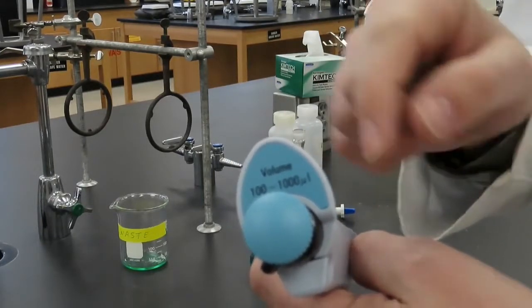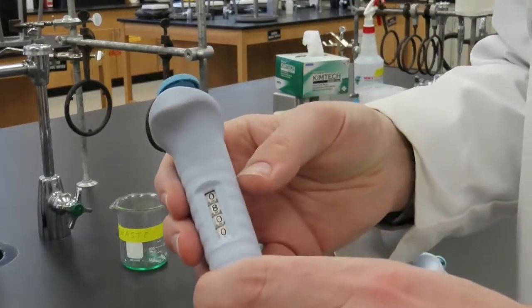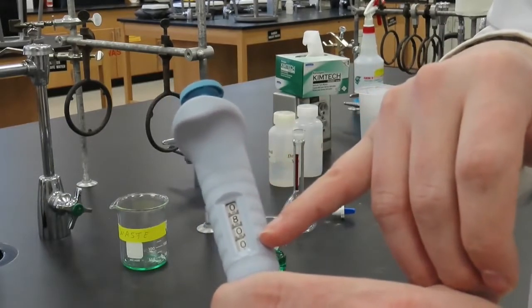For the smaller pipette, the black digits on the display represent microliters. Therefore, the volume is currently set at 800 microliters.